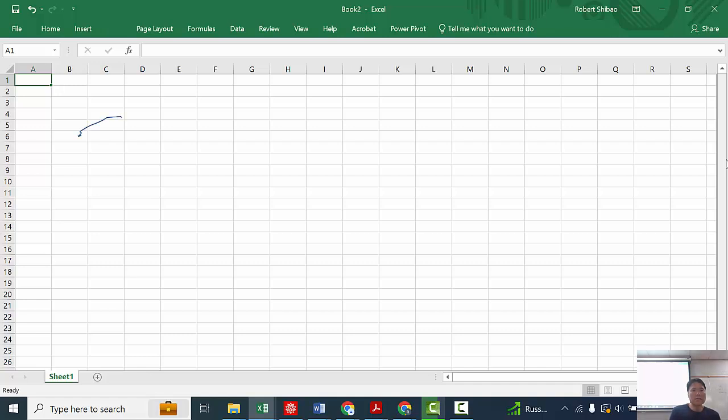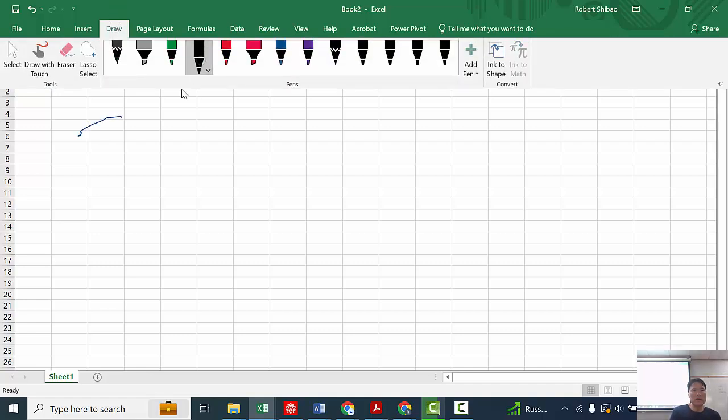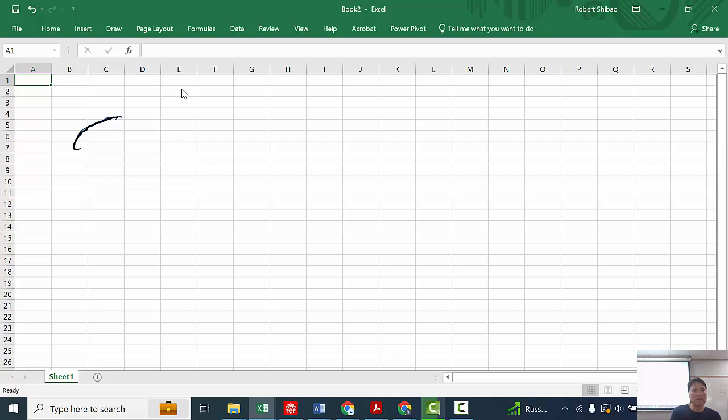Experiment. And so the first step is we need to free up the sulfate. Right now the sulfate is locked in a solid lattice, and we have to free it up. In other words, we have to dissolve it. And dissolving it is not so easy, because if we can dissolve it, that will free up the sulfate. Sometimes these samples are easy to dissolve. Water will do it. And so we could just use water. For our samples, water is enough. But when you get to more advanced classes, water sometimes isn't enough.